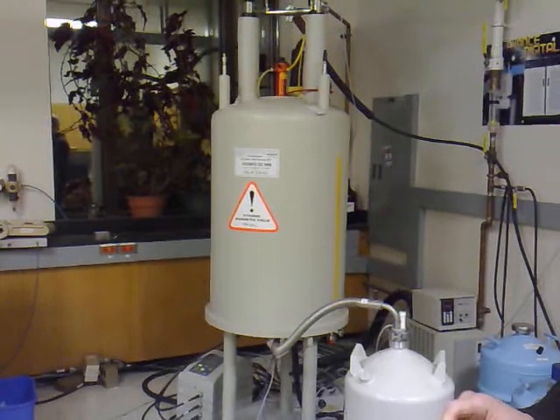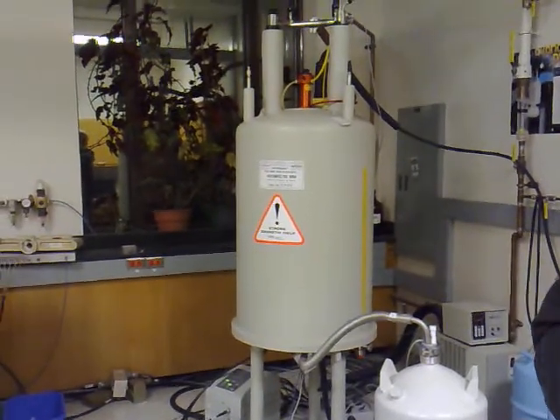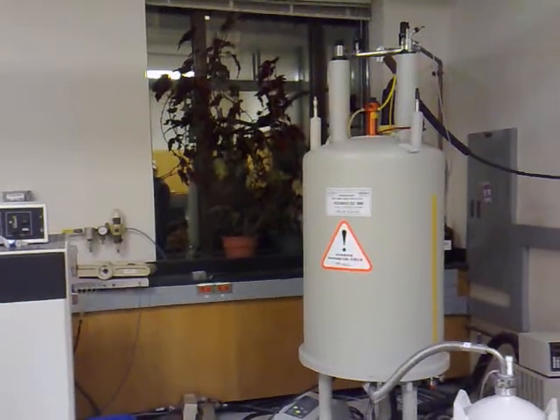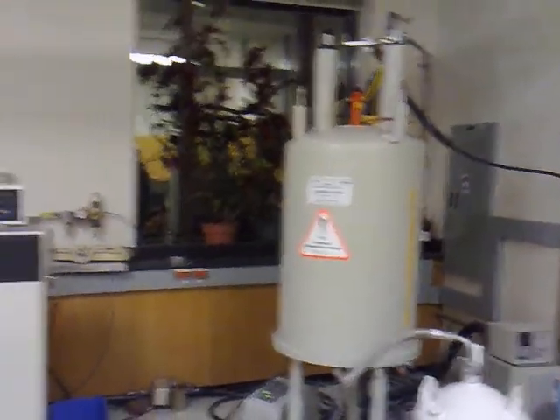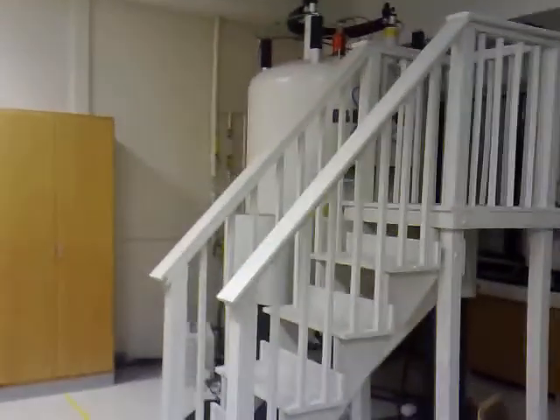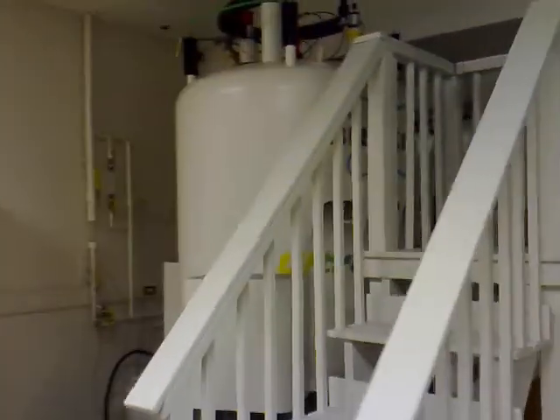We've got a smaller one right here — a smaller NMR spectrometer. This is a 400 megahertz. That other one over there is a 600 megahertz, and that one is for solid samples.